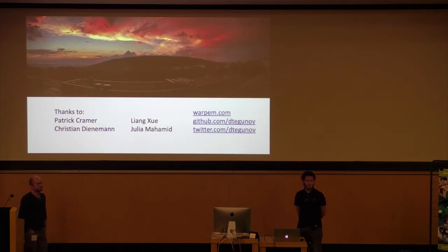You showed that you can remove the crap from your list. Can you also use that as a pseudo-fiducial marker? The way EMAN is doing it, no. I mean, ideally you would not have any of that crap anyway. And all the reference-based alignments later achieve much higher resolution than you could ever achieve with crap-based alignments. And patch tracking works for pretty much all of those data.